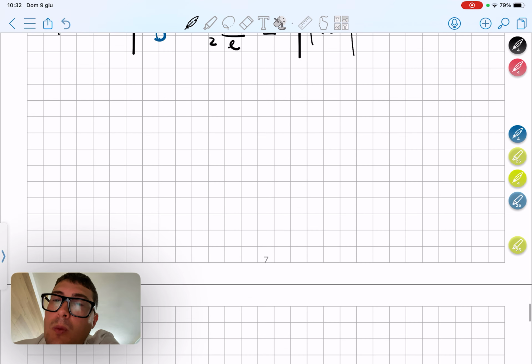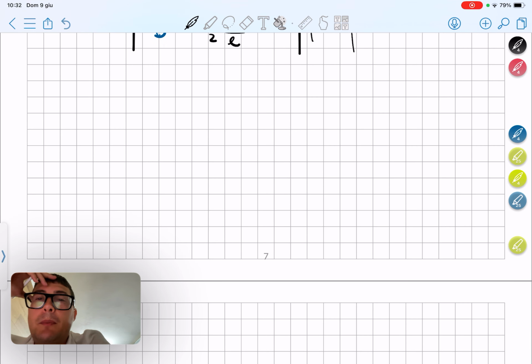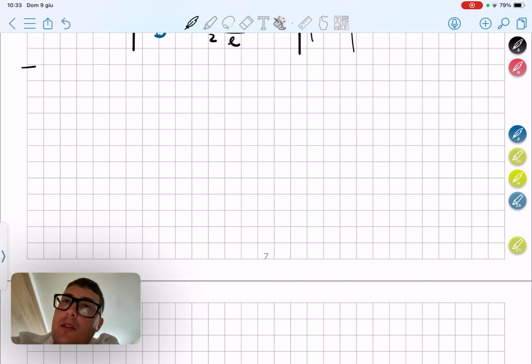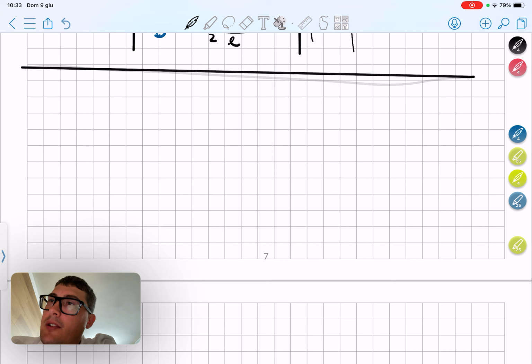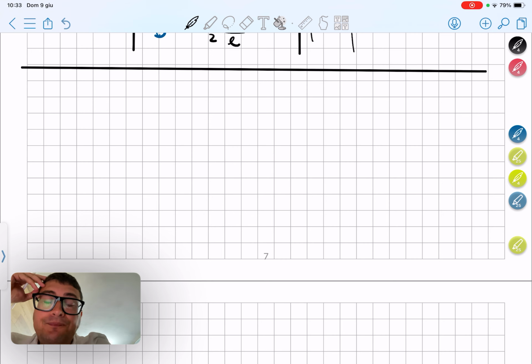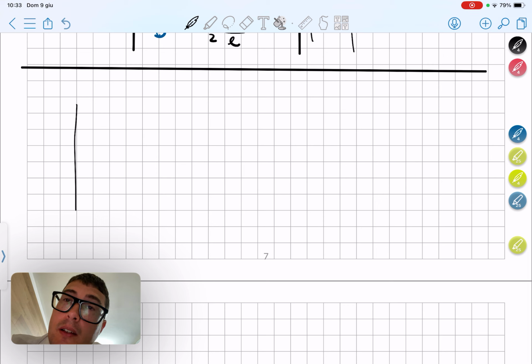Okay, so we can move a little bit ahead. We have introduced the fact that the cantilever is subject to the forces of the sample, as well as the sample is affected by the forces of the cantilever. So we can identify different regimes. Okay, let me put it into micron.